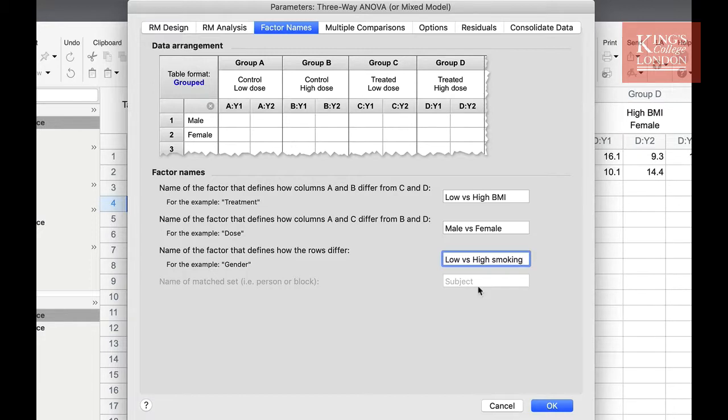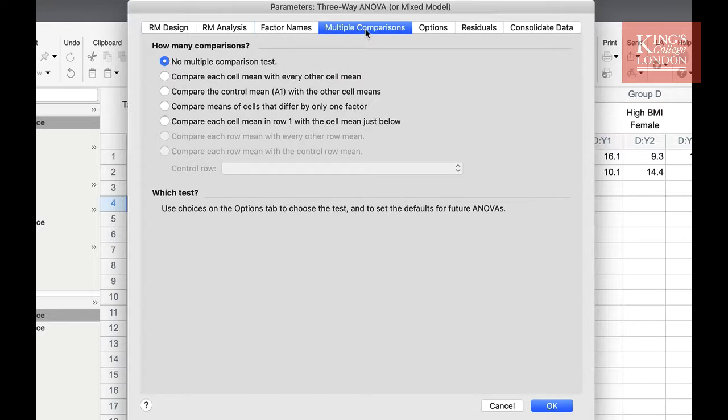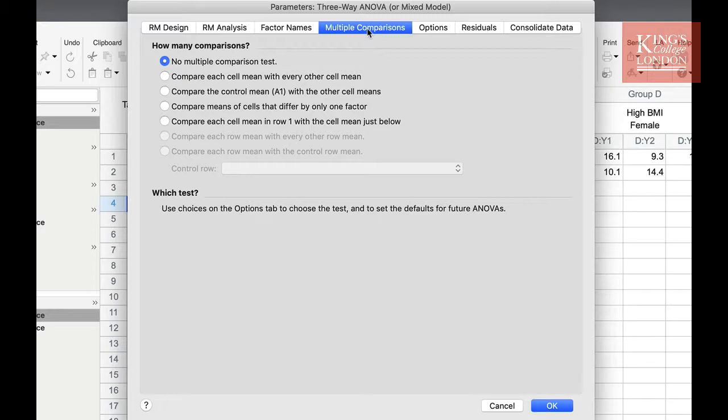Once we have defined our factor names, we move on to the multiple comparisons tab. Once you've carried out the basic three-way ANOVA, you have the choice of running multiple comparisons. Rather like a one-way ANOVA, you can choose which columns and which groups you compare to which other groups or columns, depending on your experimental design.